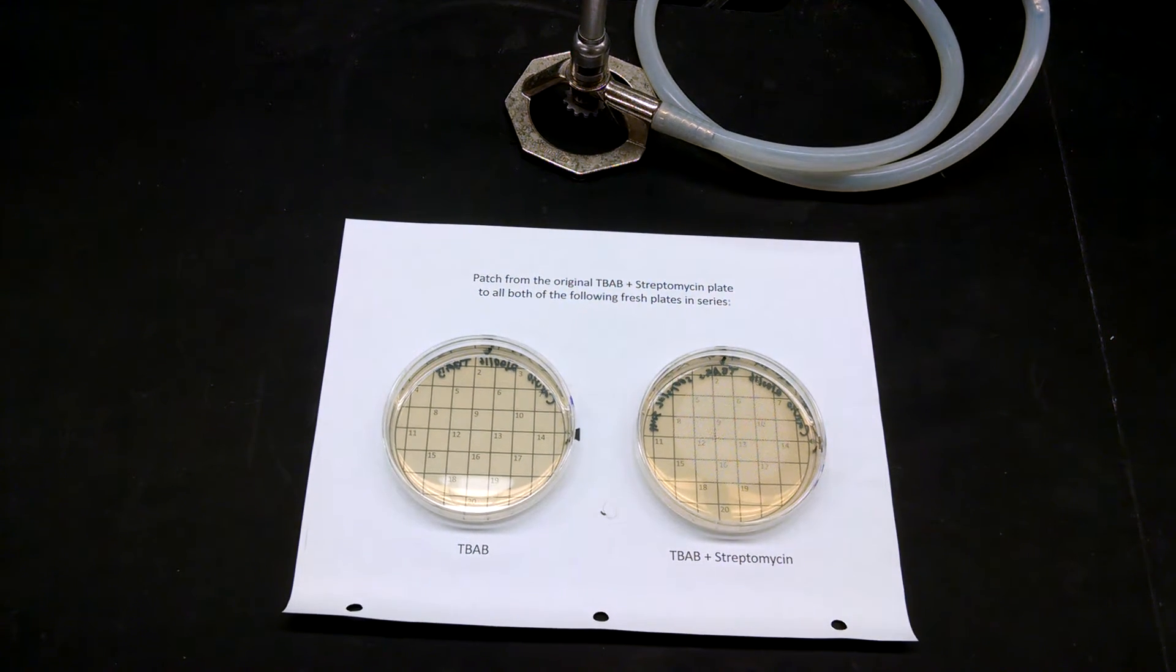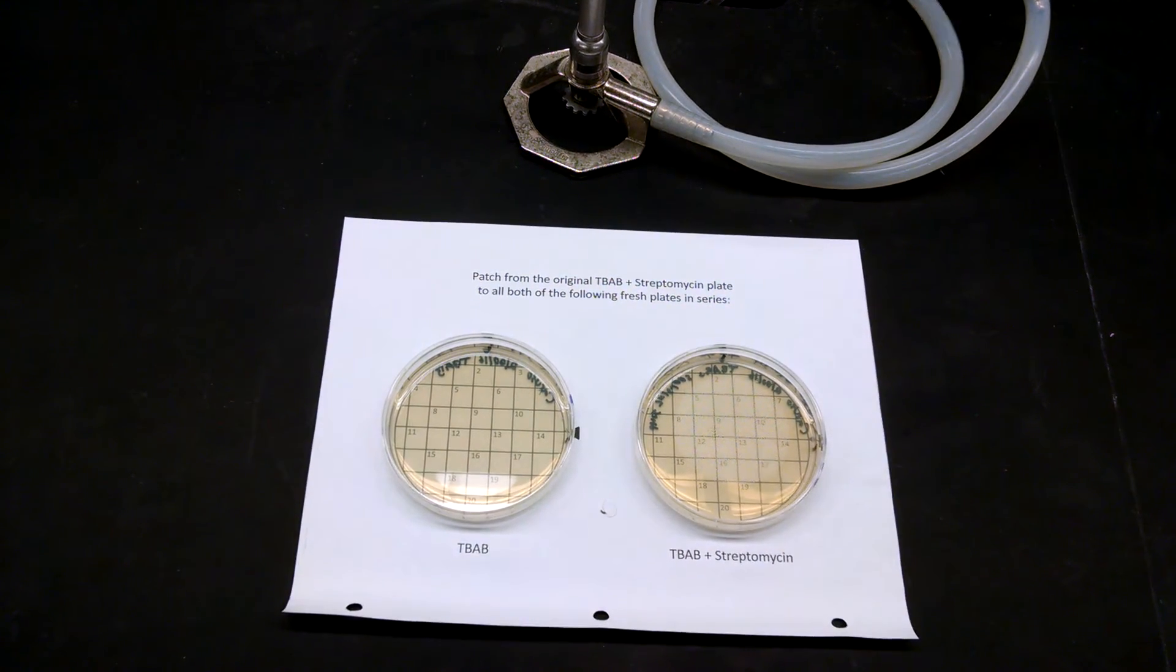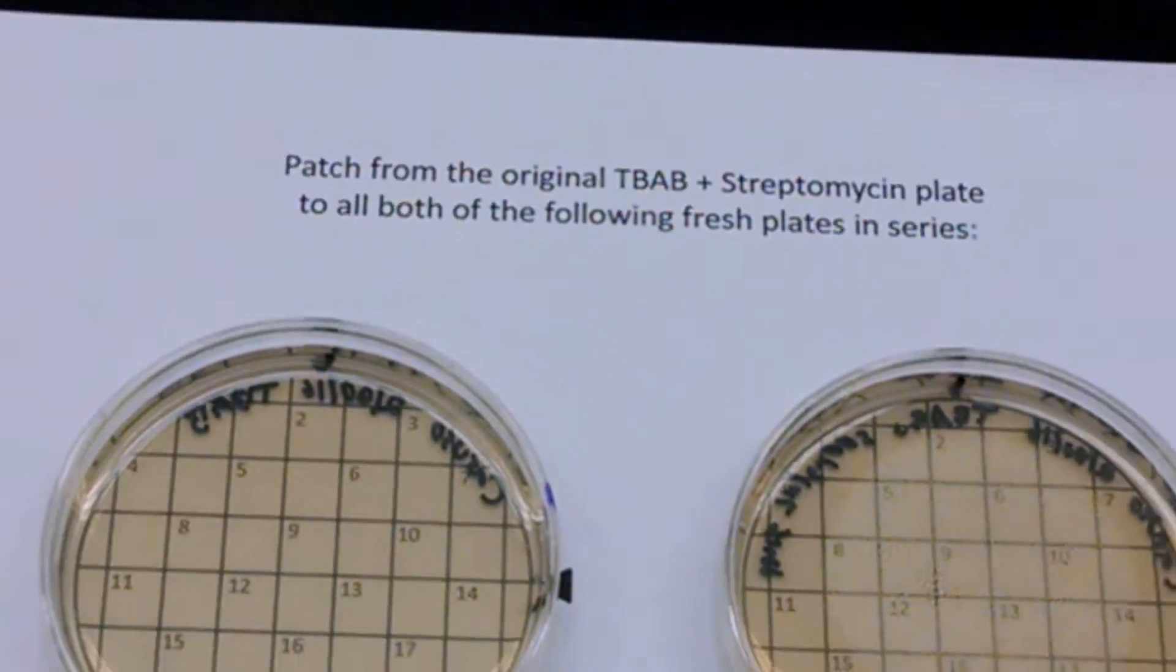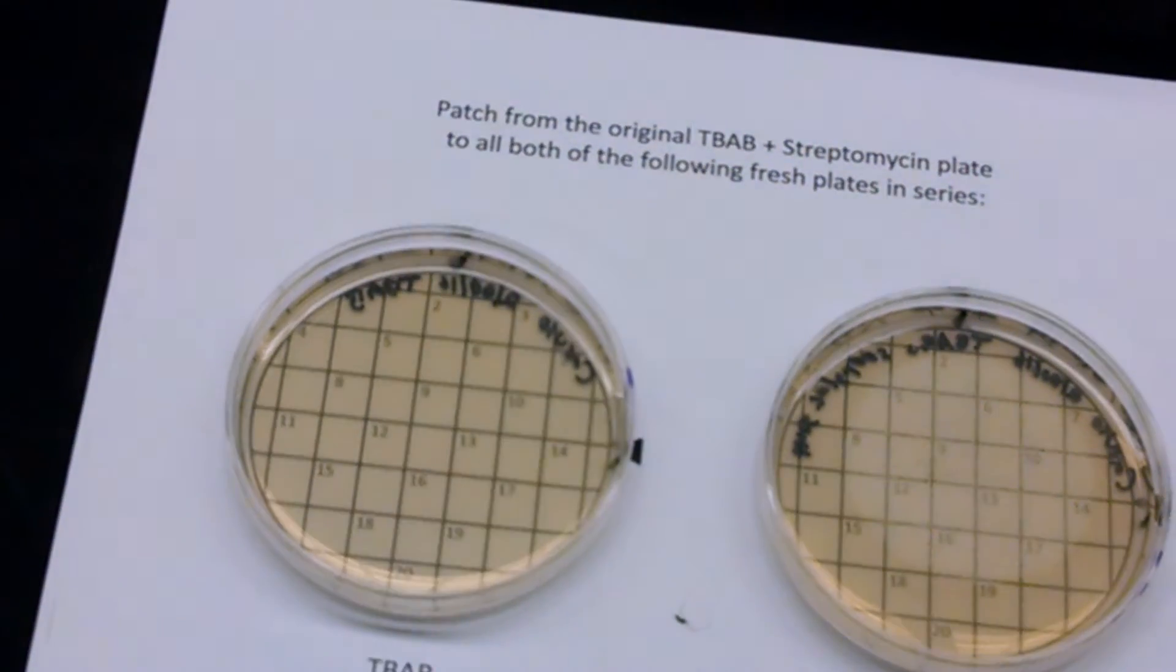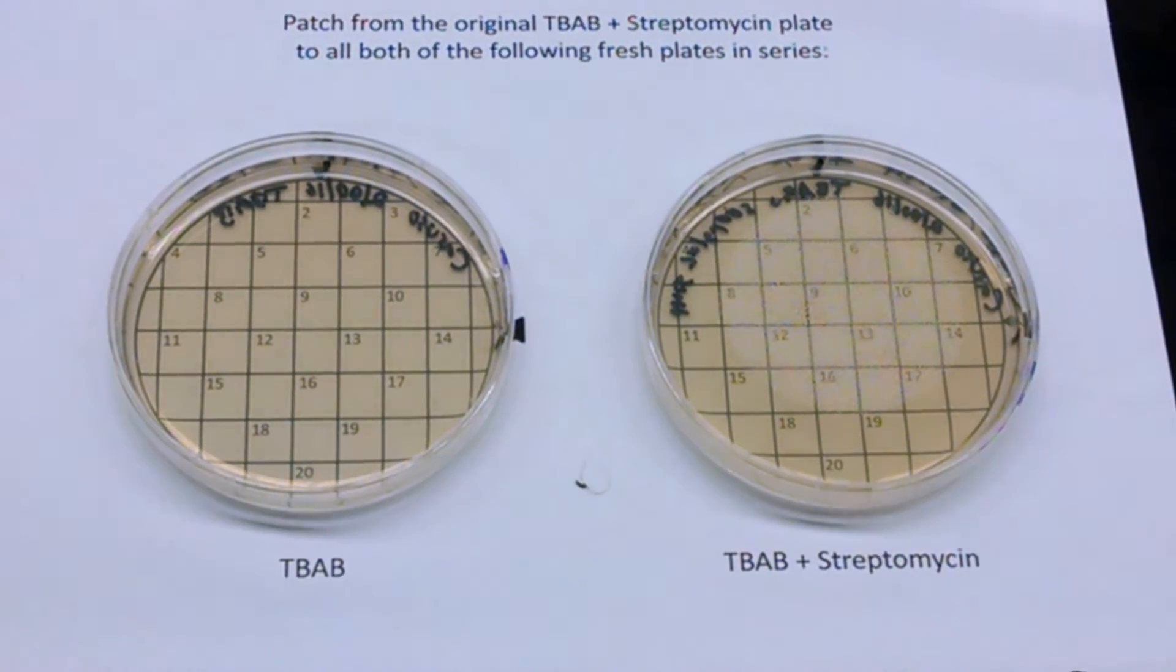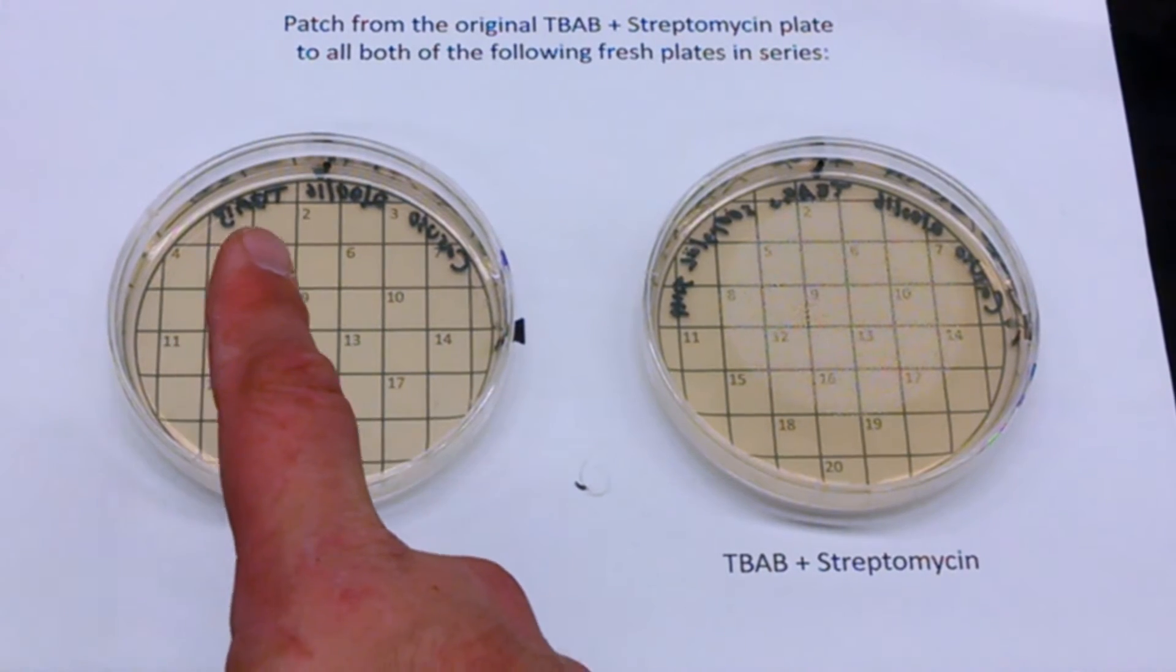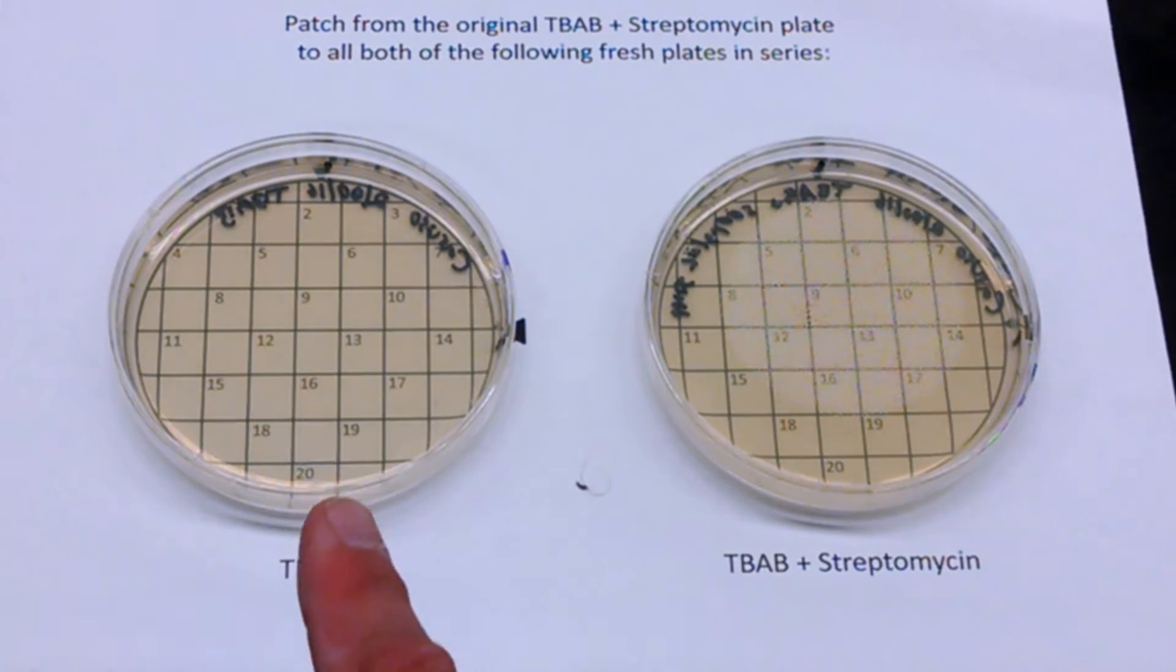Ah, I can. All right. Very good. And so what you will see is I've given you a grid underneath it, and the grid goes from 1 to 20. So you're going to be able to patch up to 20 colonies on here.